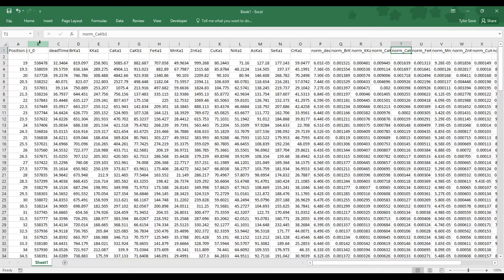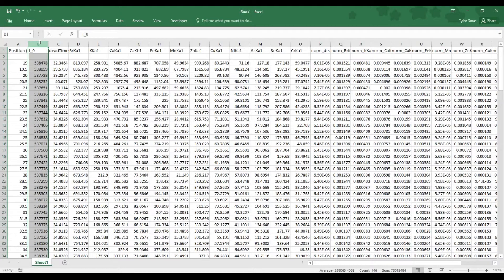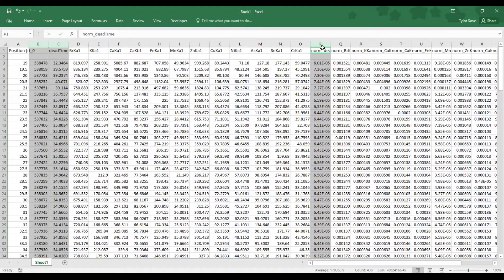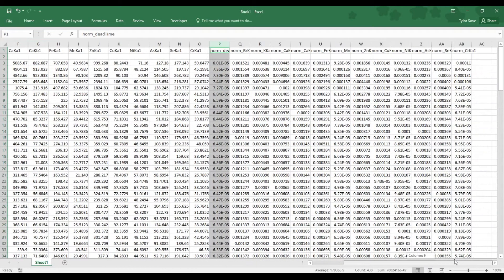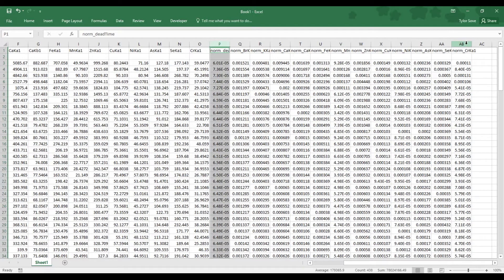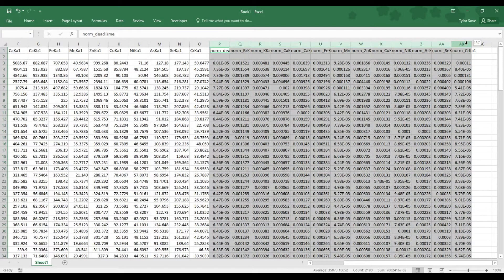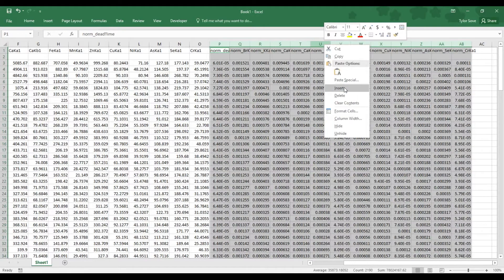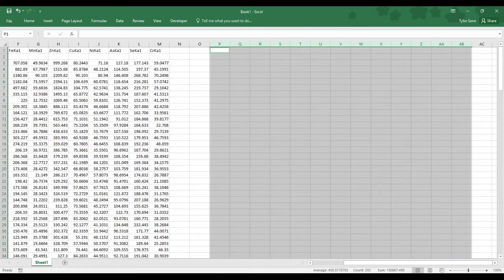So, select Column Header B, hold Ctrl as you select Column Header C and Column Header P, but once you have selected Column Header P, hold Shift as you scroll over to the side here, and holding Shift as you select Column Header AB. That will select every one of these in between. Right-click any of the column headers that are highlighted and select Delete.